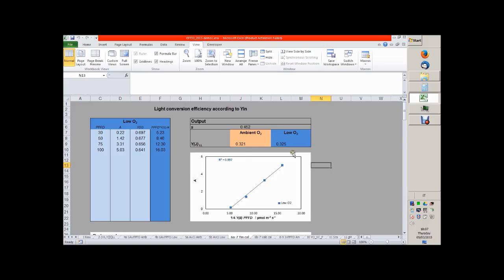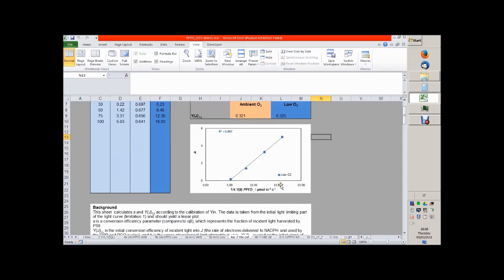The derivation of these two parameters is completely automatic, so the only thing that needs to be done is to check that the plot is linear. Similarly to what we have seen before, the limitations can be adjusted to add or remove data points.